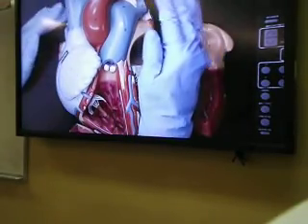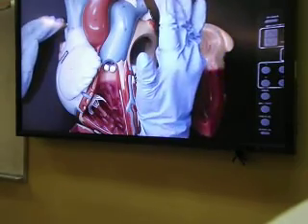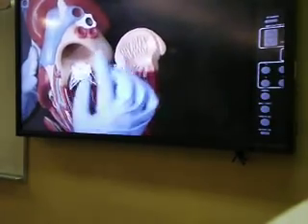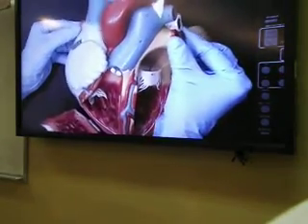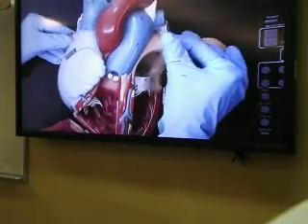Okay, so once the oxygenation of the blood takes place, that oxygenated blood will now be coming to the left atrium via 4 pulmonary veins. Now all veins in our body carry deoxygenated blood except the pulmonary veins.